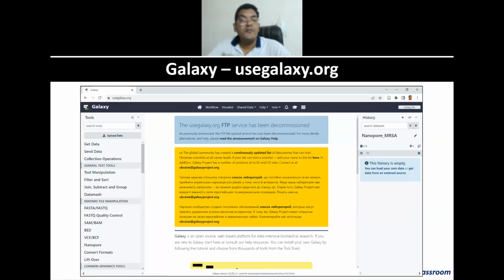Then we move on, and of course you can name your history so that you know what you're doing, and if you want to come back after, let's say, 2 days, 3 days, or 2 months or 2 years time, you still can go back to your history and you know exactly what you did the last time you were doing the analysis. So you name your history using this pencil button. The pencil button is for editing. You can use this to rename your history and also to rename your files.